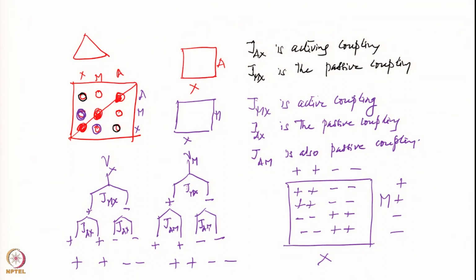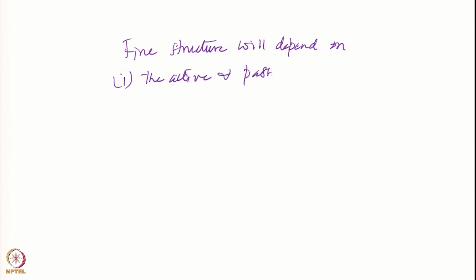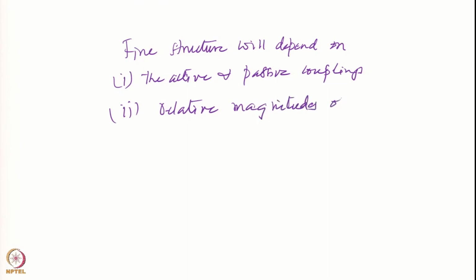Okay. The fine structure will depend on, one, the active and passive couplings, and two, the relative magnitudes of the active and passive couplings.